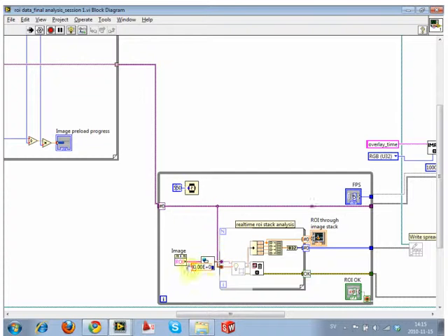Right now you can see the data is running along to here and it's feeding this through. If you actually look here, there's no error. I'm not seeing any errors in this program, which means it's not an error. It means there's some mistake in the wiring that we've done, which is not bad enough to cause an error. It's still a totally fine operation. It's just not giving us the right data. So we need to figure out where that is, and it's most likely in our file operation to start with.